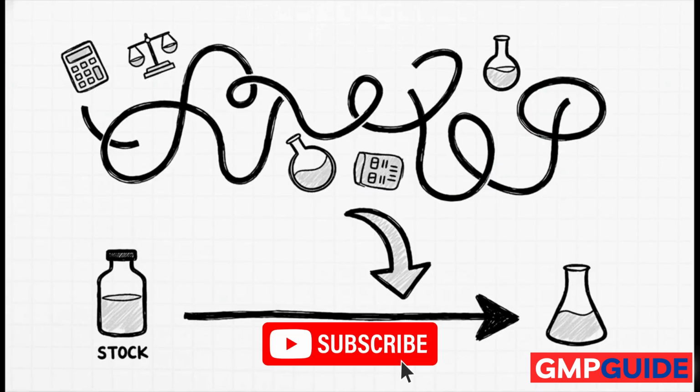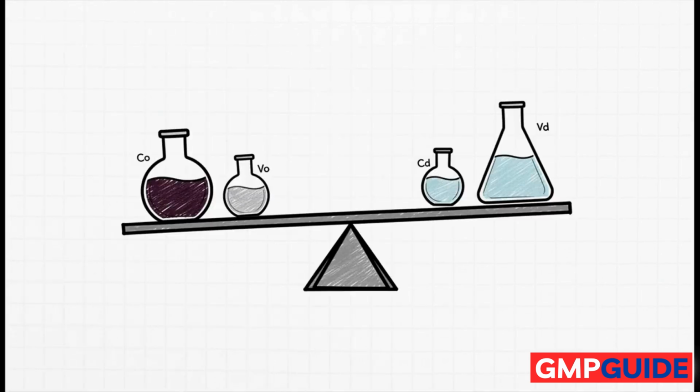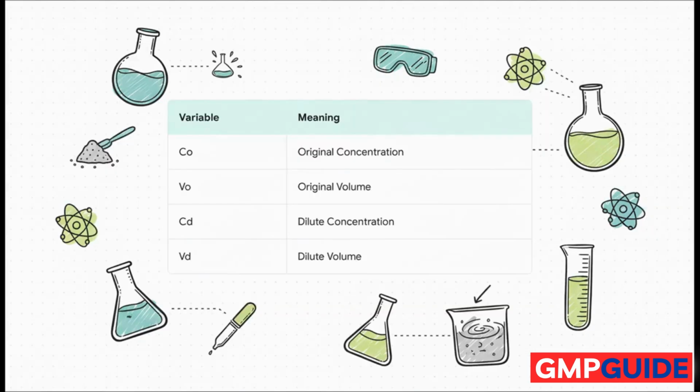All right, on to method 2, which is often way easier, dilution. It's a fantastic shortcut. The magic here is the simple but super powerful formula. It's the key to getting dilutions right. C₁ and V₁, that's your original stuff. C₂ and V₂ is the new solution you're trying to make.